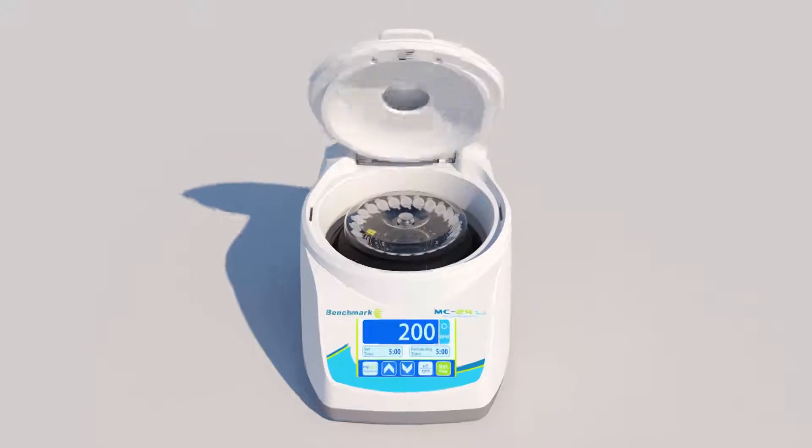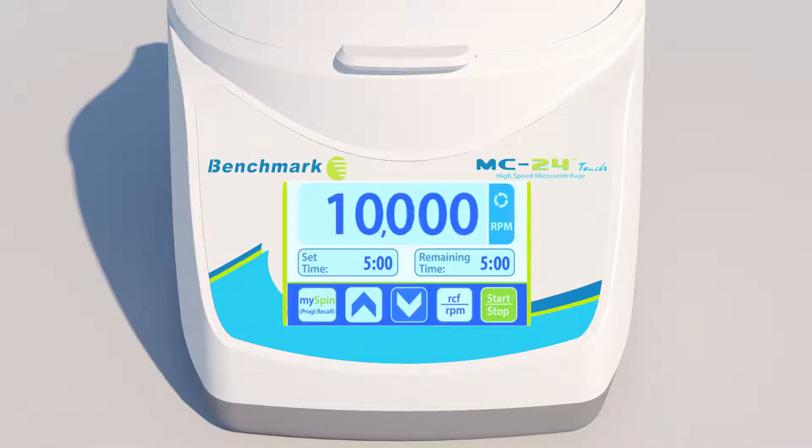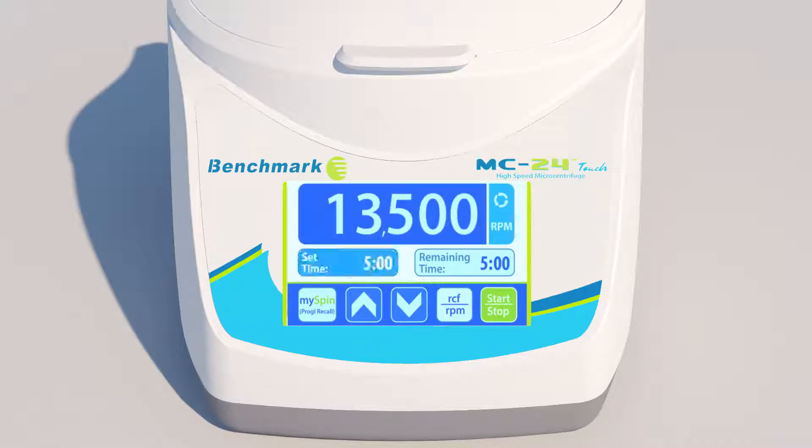After loading your samples, simply close the lid and use the large, full-color touchscreen to select the desired speed and runtime settings. To begin the centrifugation, press the Start key.